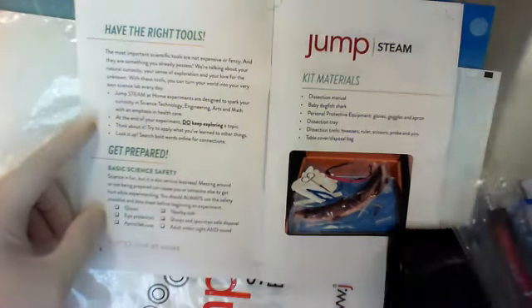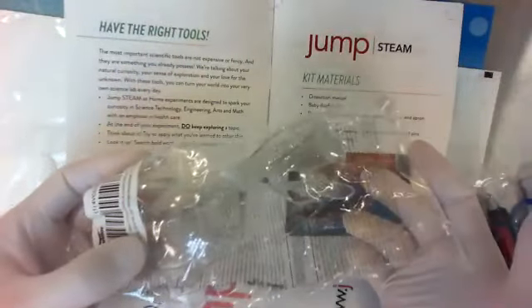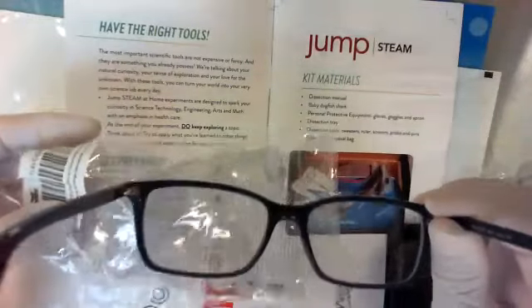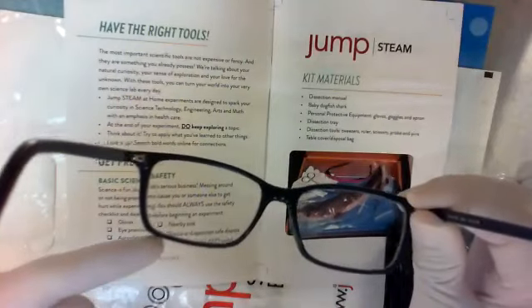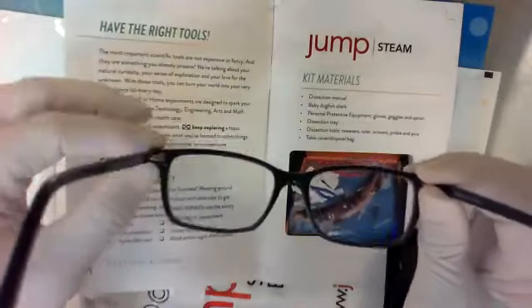Eye protection. You have goggles, disposable ones that came with it. If you have glasses on, like I do, my glasses are actually slightly bigger than the goggles, so when I use my glasses, this rests just above my cheek. And the whole point of the goggles is that anything that splashes up, you don't want it to go underneath. So you keep the goggles on tight or your glasses on tight. You wear them so that if anything splashes in general, it protects your eye.